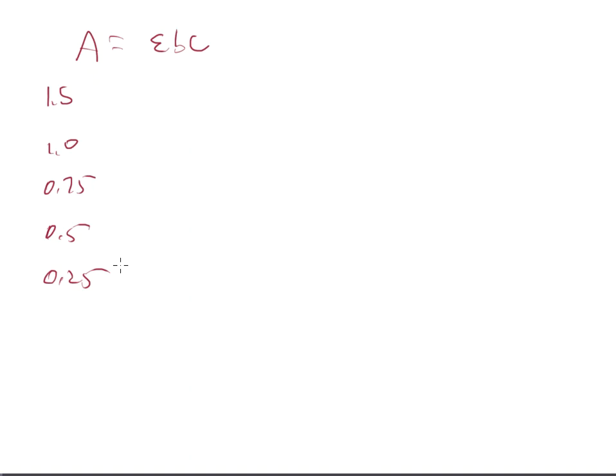All right, so what this is going to do now is, all right, I want a 1.5 absorbance. So here's my molar absorptivity. I know that value because I've looked it up in a textbook. My path length is going to be 1, and this will allow me to solve for the concentration, which is the molarity of what I need to make in order to run a standard that will give me a 1.5 absorbance or something close to it.